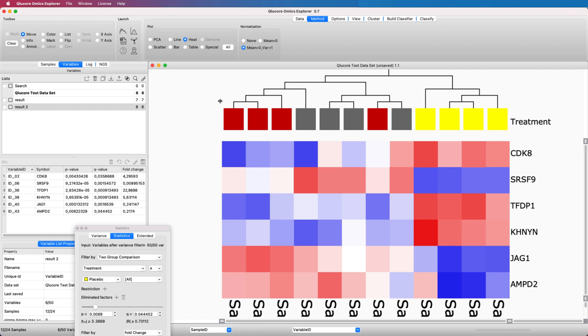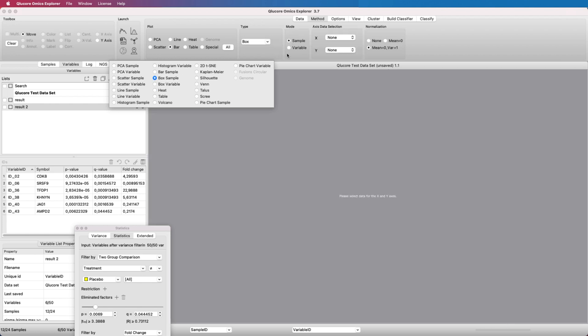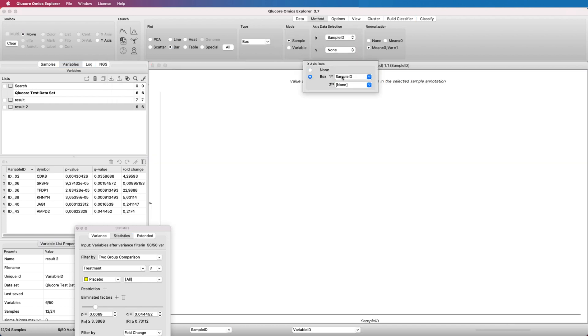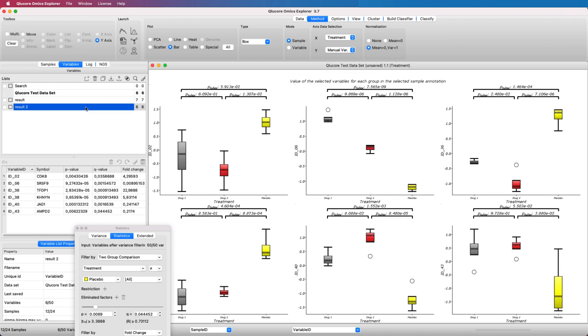Select the box plot and define the x-axis to be organized according to the treatment annotation. Select to define the y-axis by using the y-axis tool and select the result list. It is also possible to select individual variables.